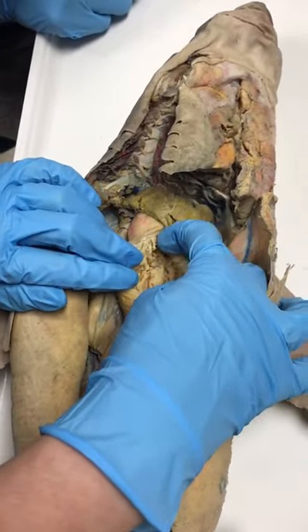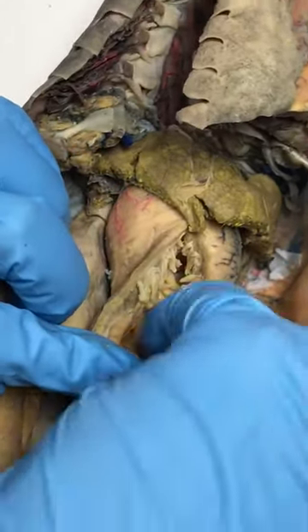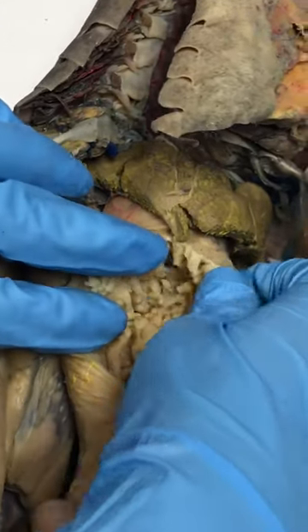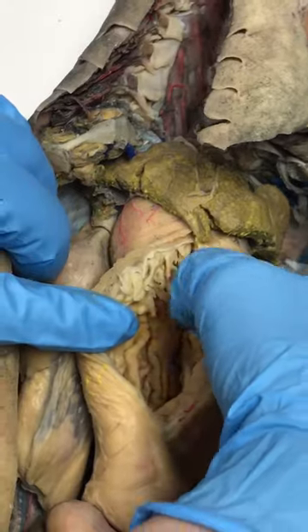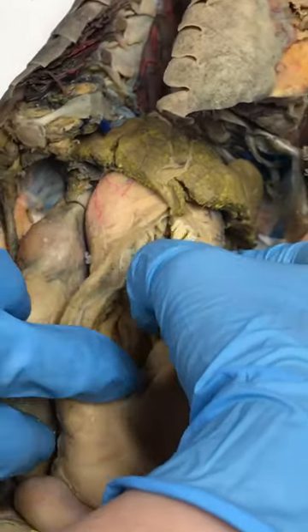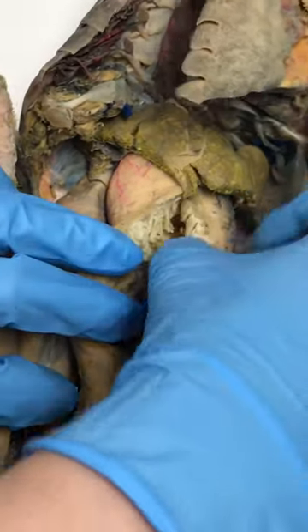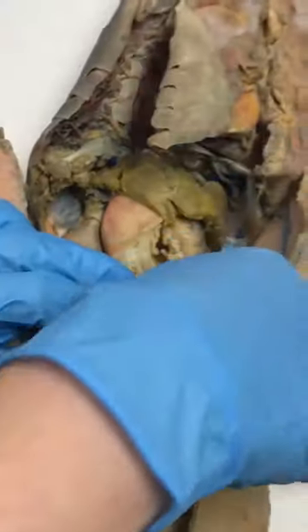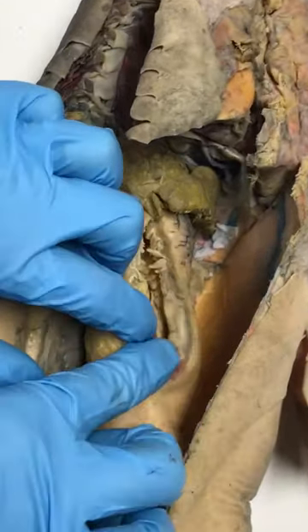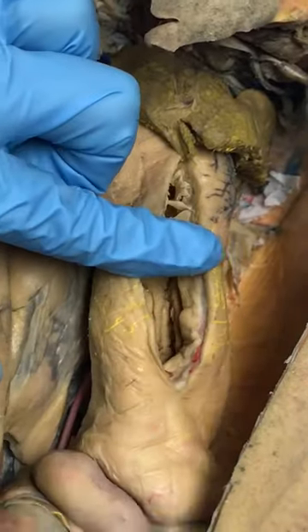The cranial portion has a different structure than the more posterior portion. These finger-like projections are papillae in the esophagus — that's why it's indented. Where it turns into folds, those are rugae, just like in the other animals, and that's the stomach.